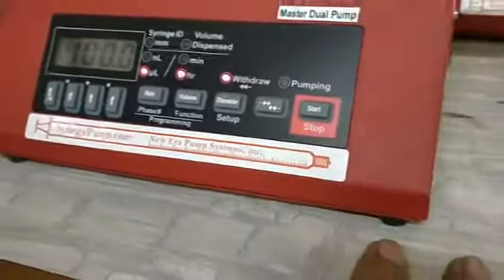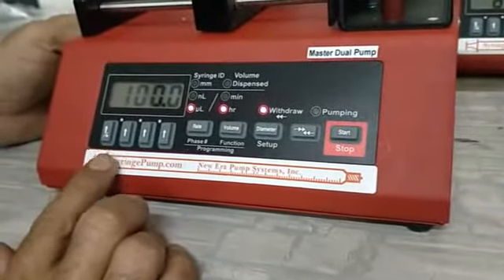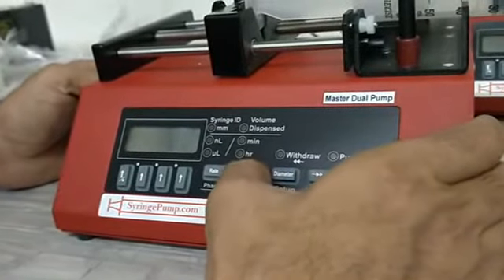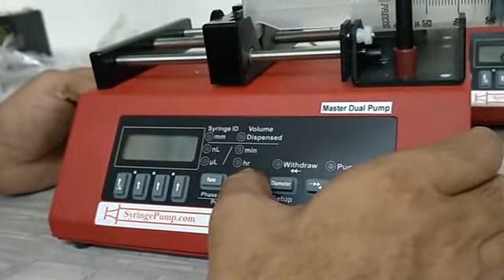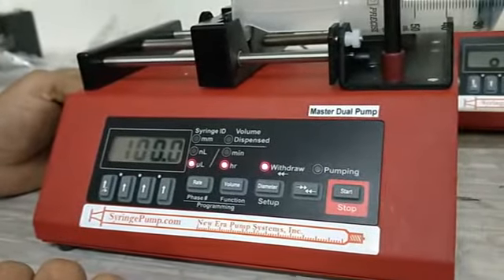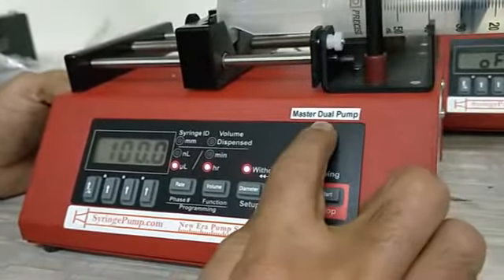Now coming back to the master pump settings. We have already put it in reciprocal mode. To do it again: switch it off, hold and press the volume or function key, then put the power on. It will show CO and T — press the left-hand arrow and it comes to RECP, which is the reciprocal mode. By doing this, we have configured this pump as the master and the other as the secondary pump.